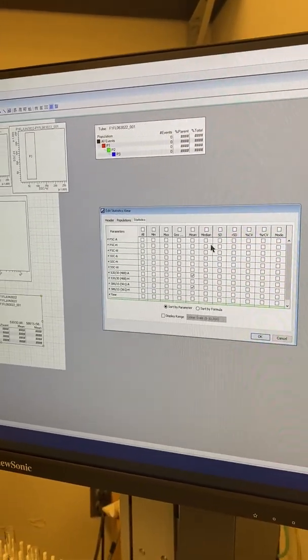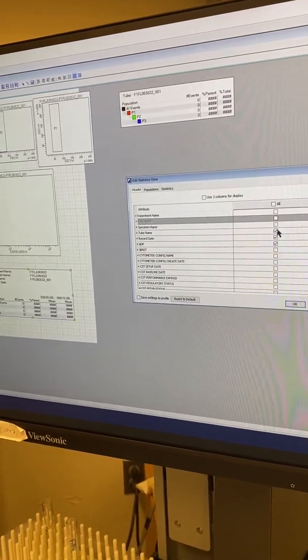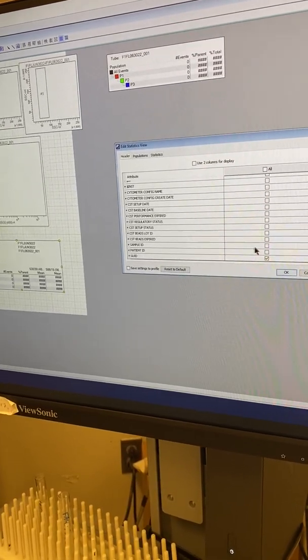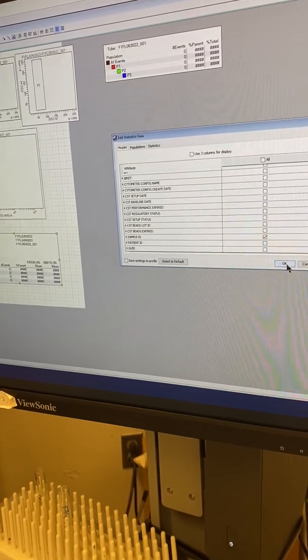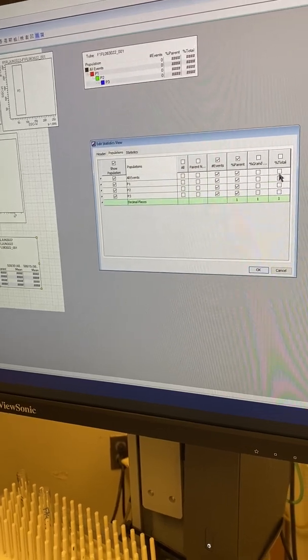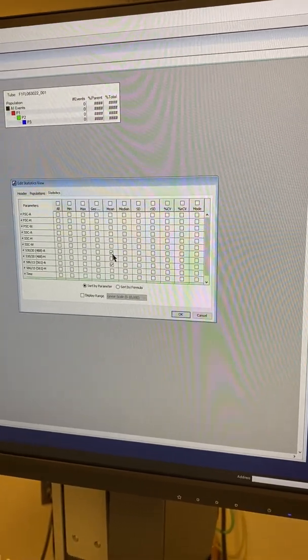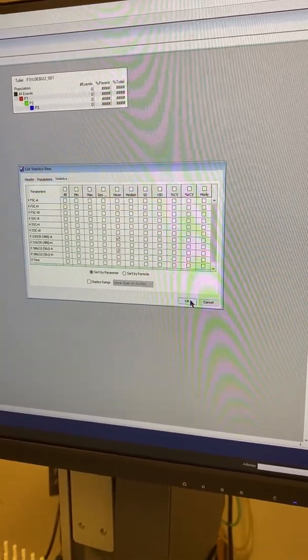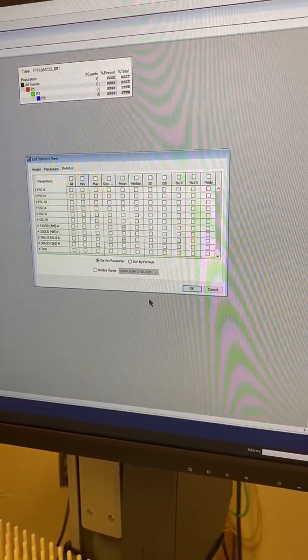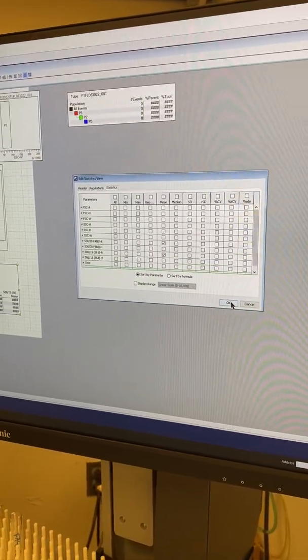Again, here are the statistics. There's a ton of them over here. The first column is a header, and that is a lot of stuff that they've thrown in here, but as we like to do, the simpler the better, and just click sample ID, and it takes a lot of things away, making your statistics and your populations a lot more simple. And for the statistics, I usually choose the mean, and then go from there. With all these statistics, you can add a lot, and there's a lot of information that you can acquire, but that also means you have to digest it as well. So I'm going to click OK.